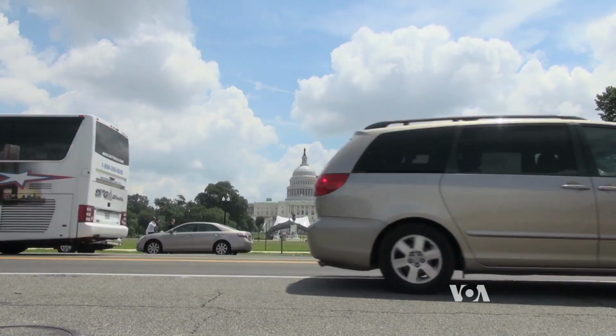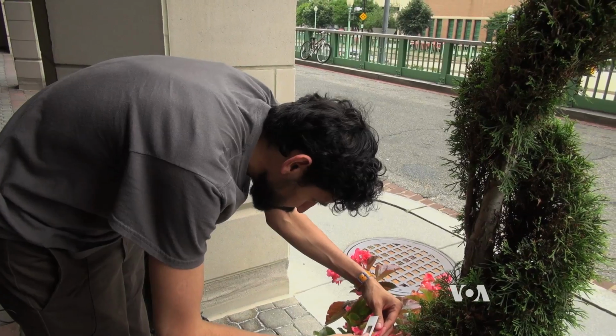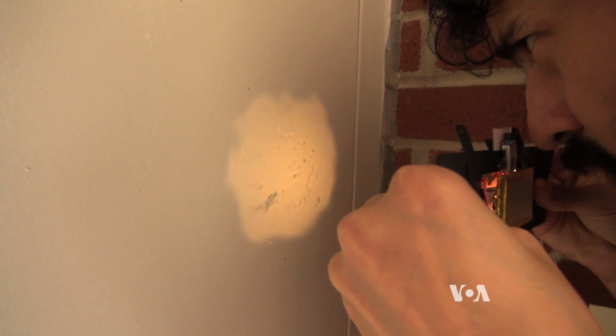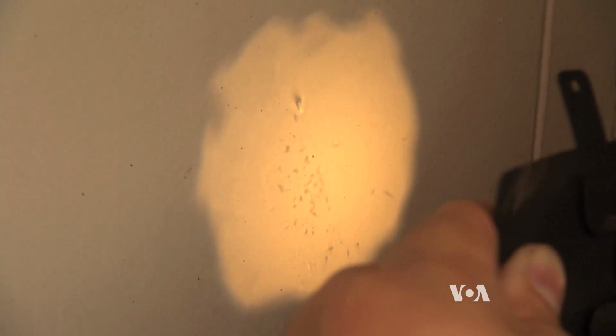In our busy lives, it's easy to ignore what's right beneath our feet. But take a closer look, says Manu Prakash. This is a piece of grass, but you notice it has these little sharp teeth. Prakash wants to help all of us peer into the invisible world around us with a microscope made of paper. So those oval-looking objects right here are all pieces of pollen. That's what's making you sneeze.